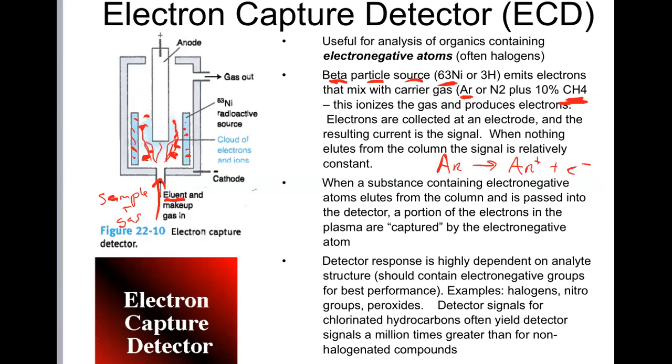So in through here, we've got this constant flow or flux of electrons being produced. Now, what are we going to do with this? Well, we're going to make a positively charged electrode in the center called our anode. And as we know, electrons are negative. This anode is very likely to collect these electrons. And indeed, that is exactly what happens. The anode continually collects the electrons which are being produced due to this radioactive decay and this avalanche of ionization which occurs within our chamber.